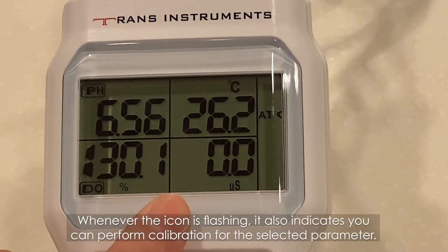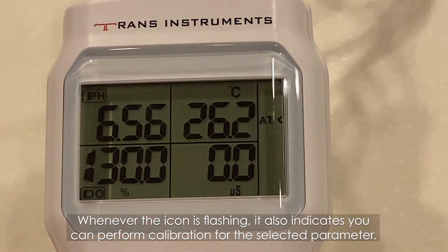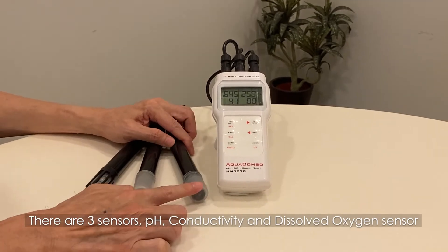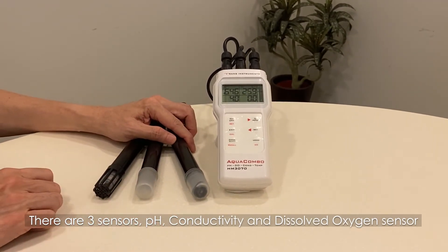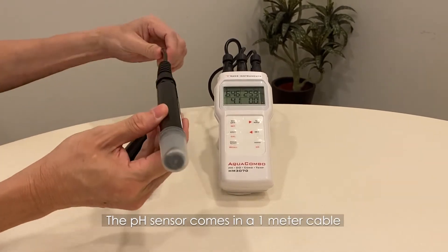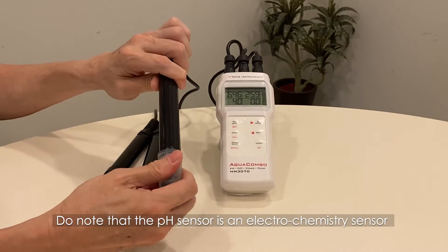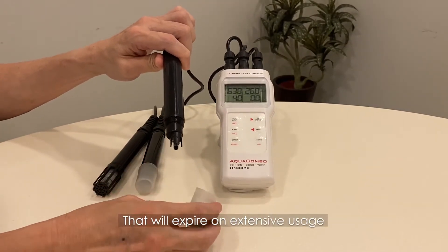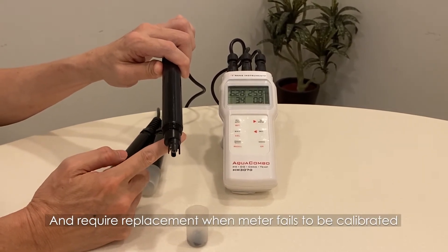Whenever an icon is flashing, it also indicates you can perform calibration for the selected parameter. There are three sensors: pH, conductivity, and dissolved oxygen. The pH sensor comes on a one-meter cable. Note that the pH sensor is an electrochemical sensor that will expire with extensive usage and will require replacement when the meter fails to be calibrated.